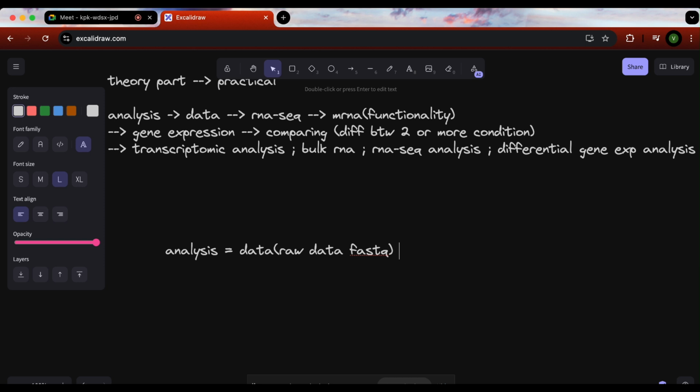Right now we are not talking about the genome, we are just talking about that if an unknown fragment is present, the machine should be capable of reading the information that at this particular position this is present. Okay, and that format is saved as FASTQ. Okay, we will look into that file's details later on once we are done with our practical part.